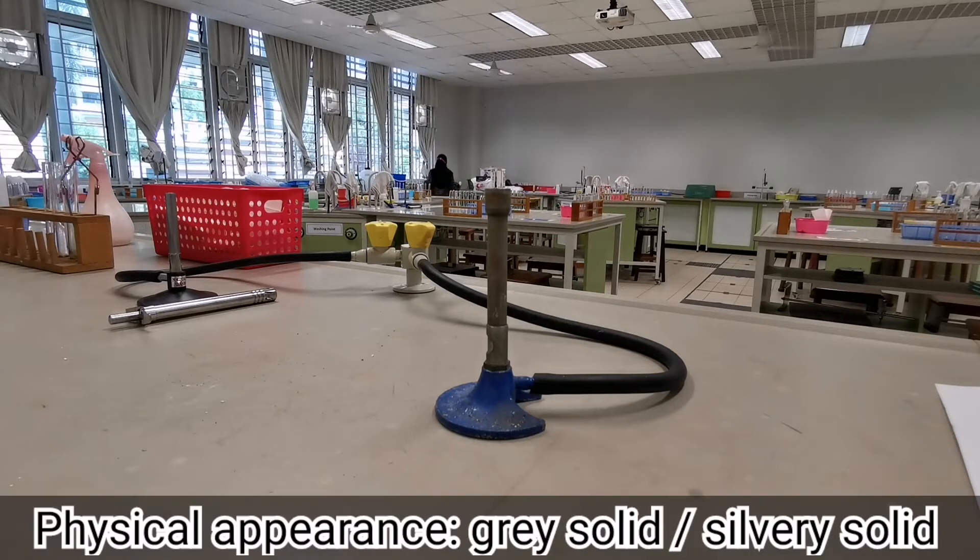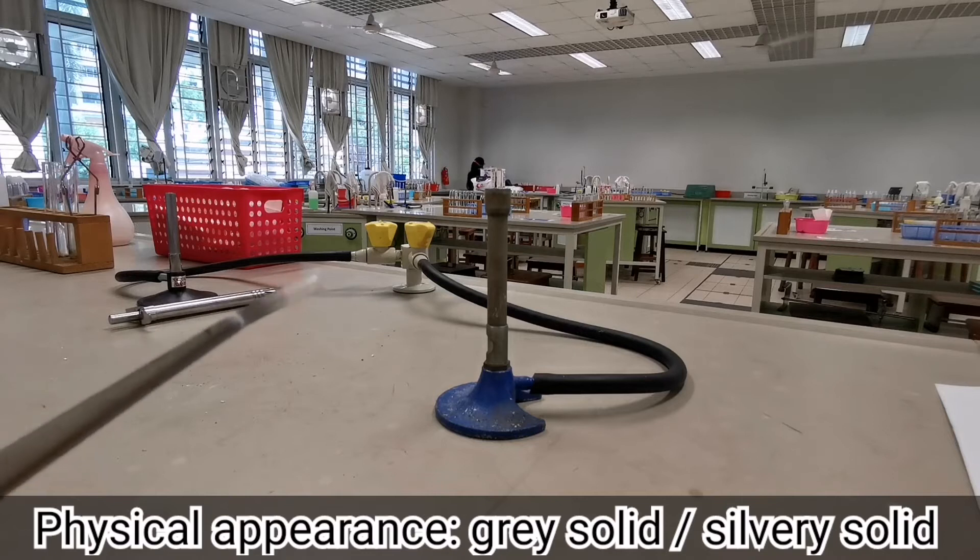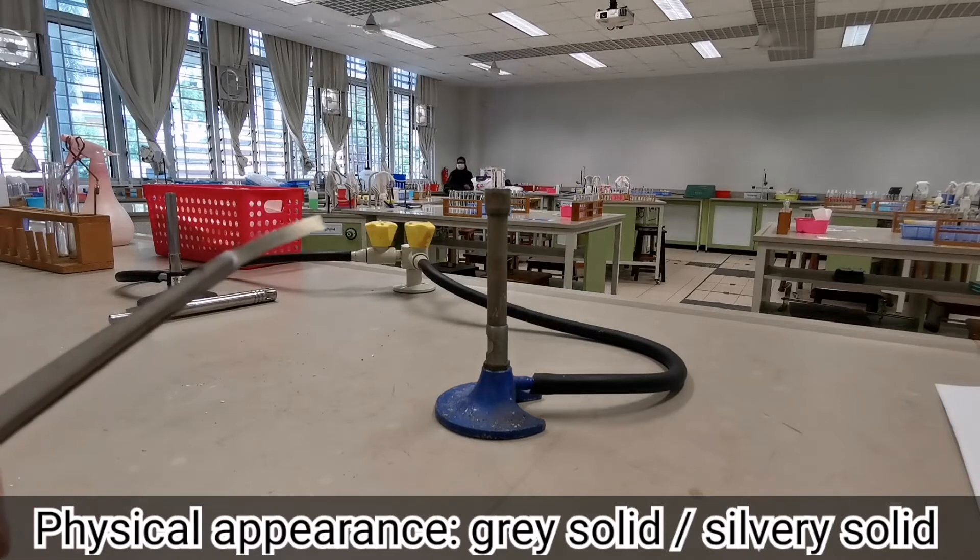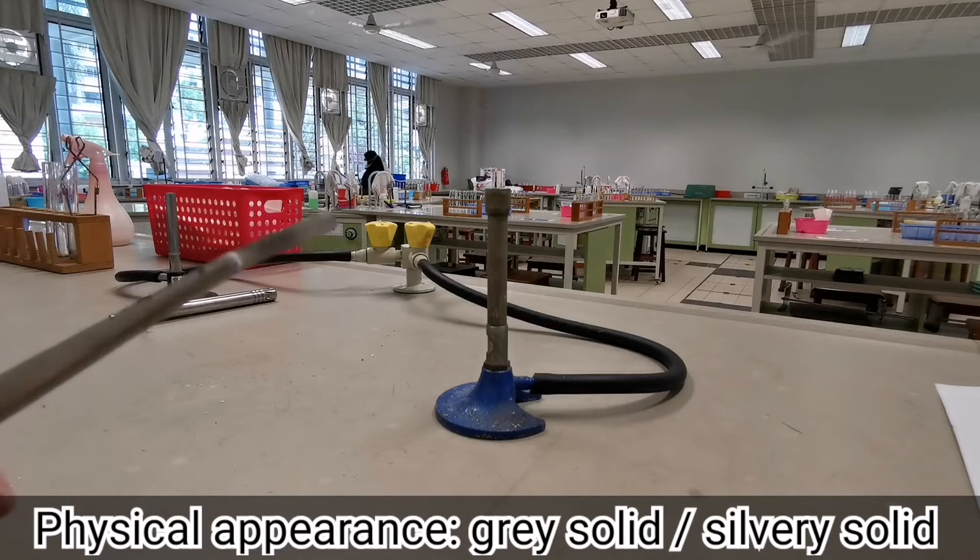First up, let's observe the appearance of the magnesium strip before heating. As you can see, the magnesium strip is a grey solid or a silvery solid.